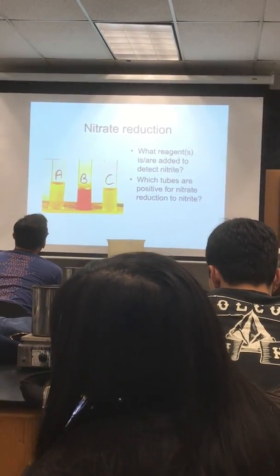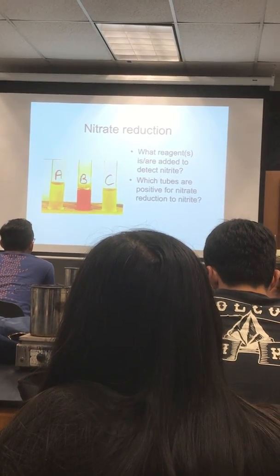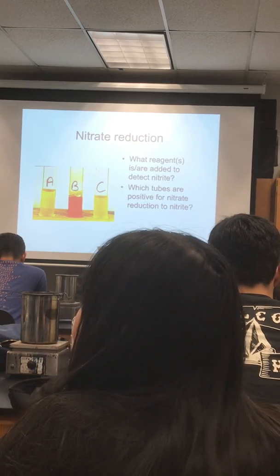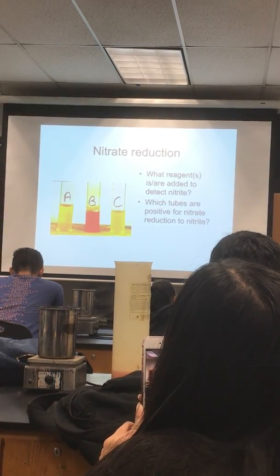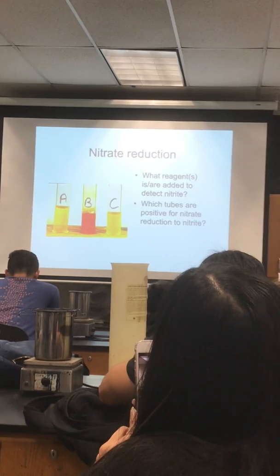Reduction in terms of the unknowns, and in fact, putting together your unknown charts, nitrate reduction actually had a part somewhere in the identification of the pseudomonads.